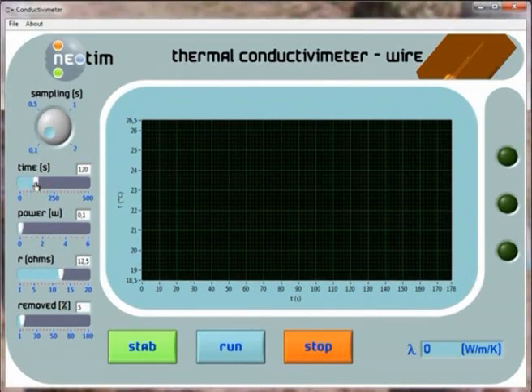An intuitive graphical interface controls the system. You enter the test duration, the heating power and the resistance of the used probe.